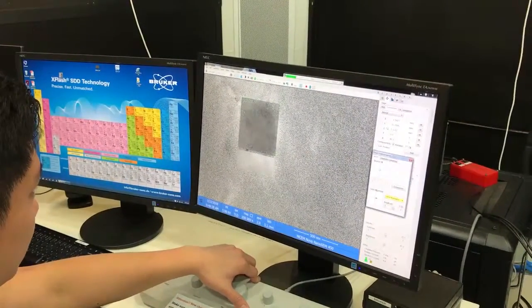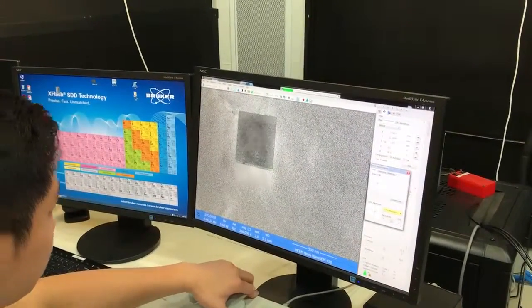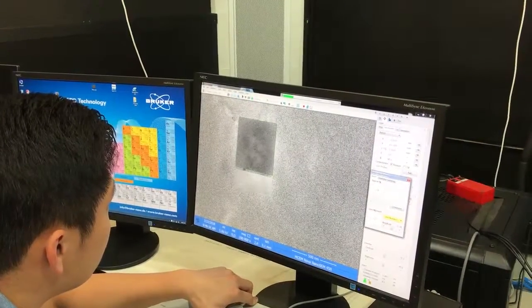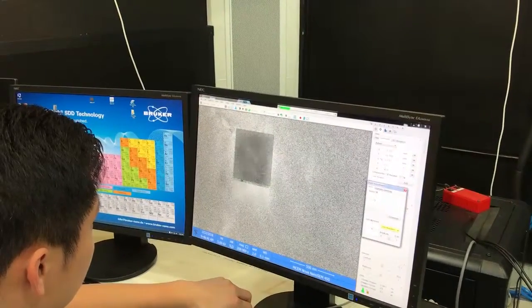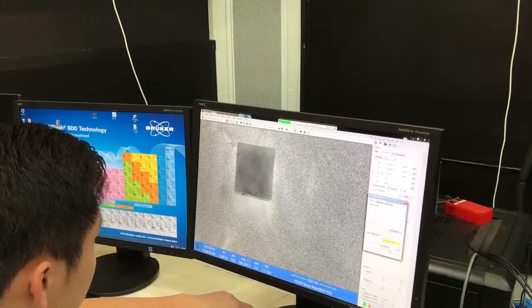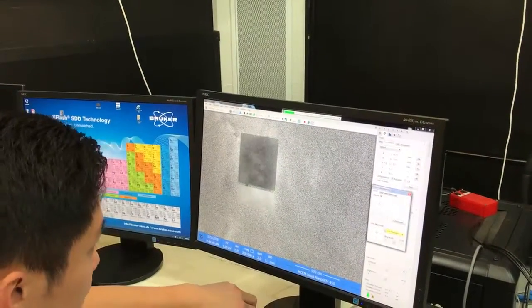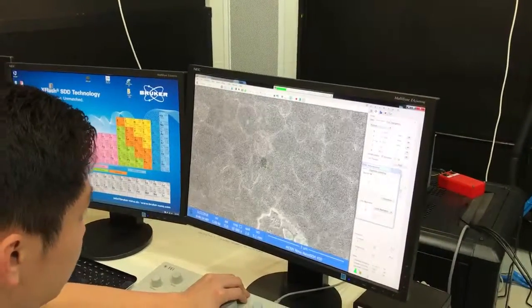The bigger the wobble, the worse the alignment, essentially. Okay, you're trying to minimize the wobble, so that you're going in and out of focus without movement of the image. Essentially, you're minimizing the effect of defocus on the scan coils. Let me just go look for other features.